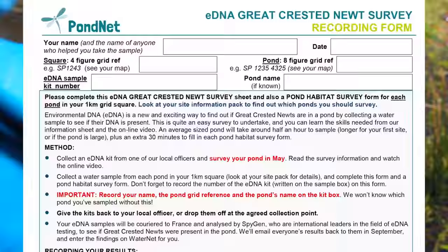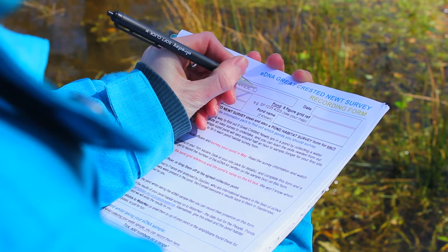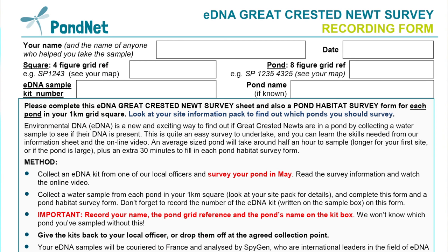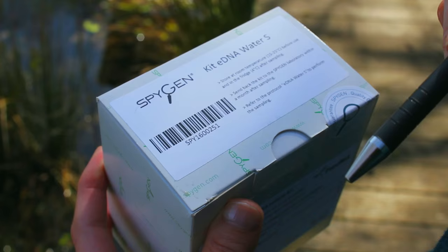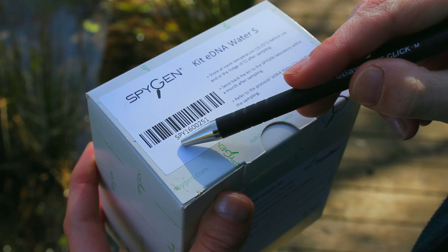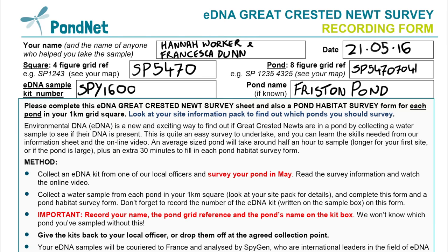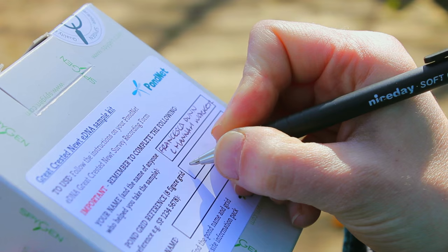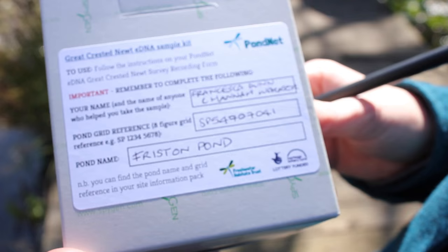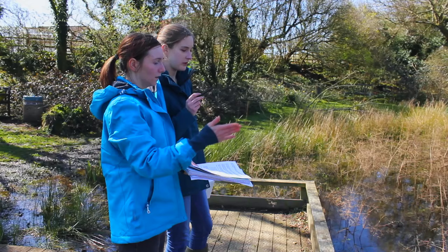You will also need the survey protocol and eDNA recording form. Before we take the sample we need to complete the paperwork. Firstly, write down the names of everyone who's taking part in the survey today — please give your first and last name. Write down the pond name and grid reference, which you can find on your site information pack, and don't forget to include the date. Then write the kit number from the side of the box containing the eDNA testing tubes into the space provided on the form. It's very important to write the same information on the label on the side of the eDNA sample kit, so that we can keep track of the kits when they return to the lab to be analysed.